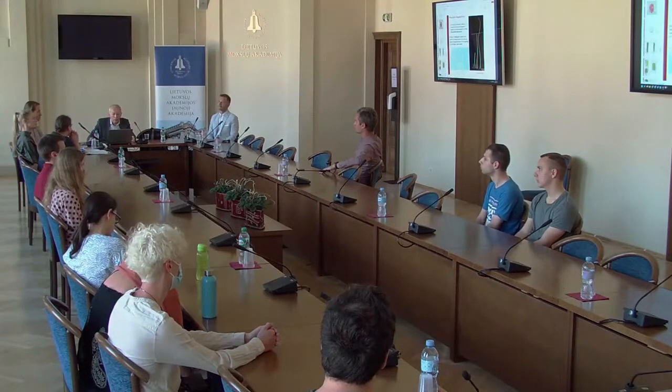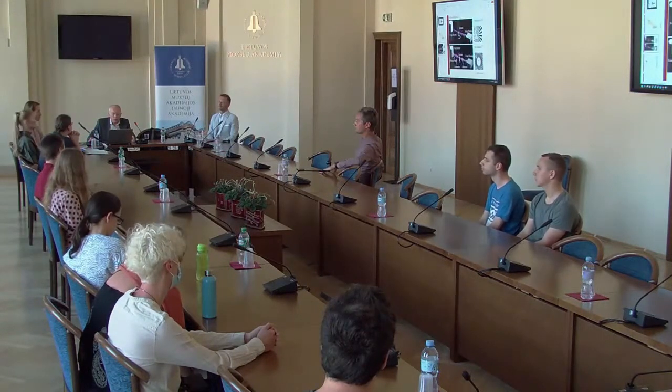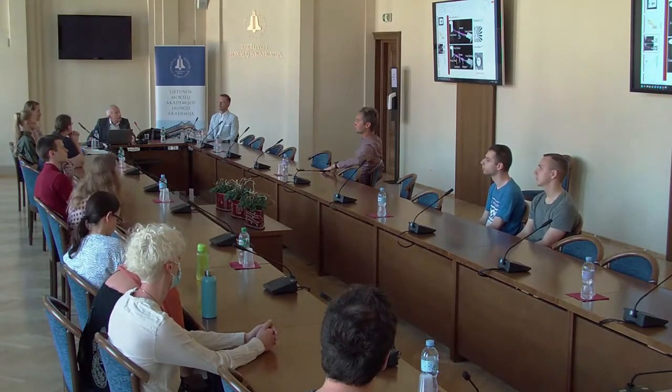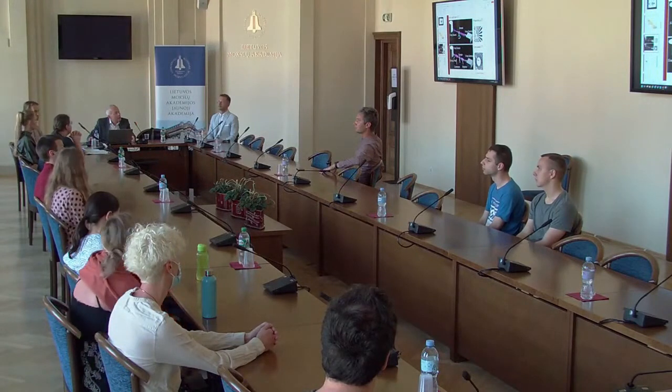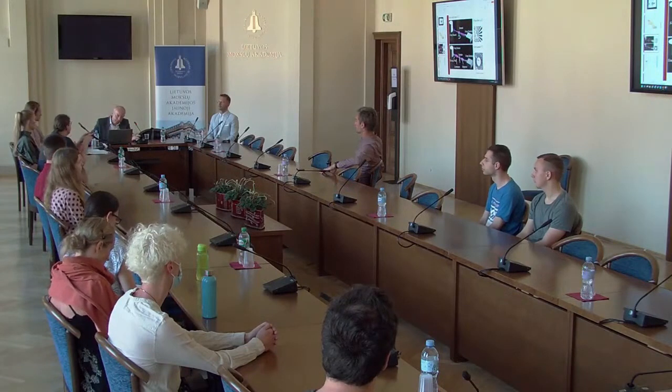Jo, kažkur taip. Irgi kokių 10-15 metų nano-CT irgi yra. Jis dirba biškį kitokiu režimu, nei aš čia rodžiau. Micro-CT turi tą geometrinį didinimą. Nano-CT, kuris eina iki 50 nanometrų, čia ko gero 30-50 ko gero.